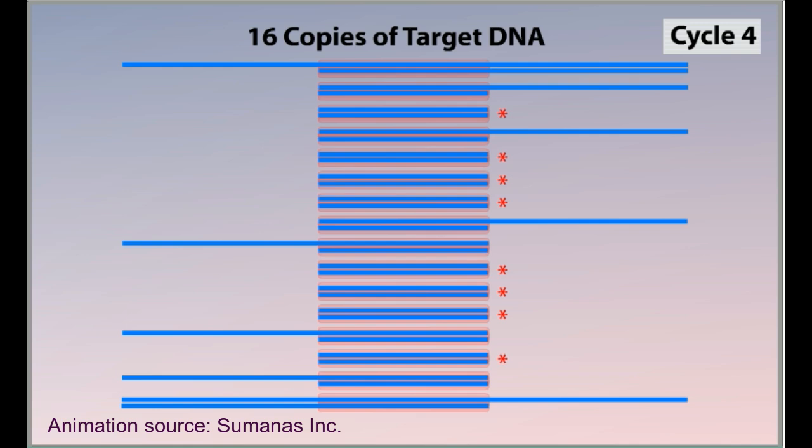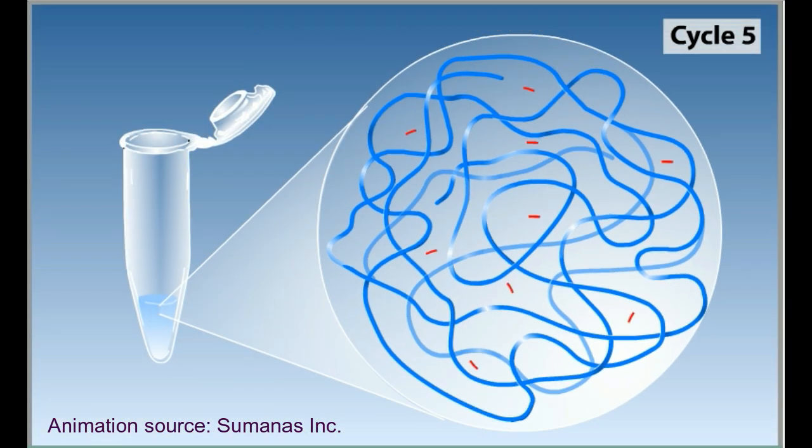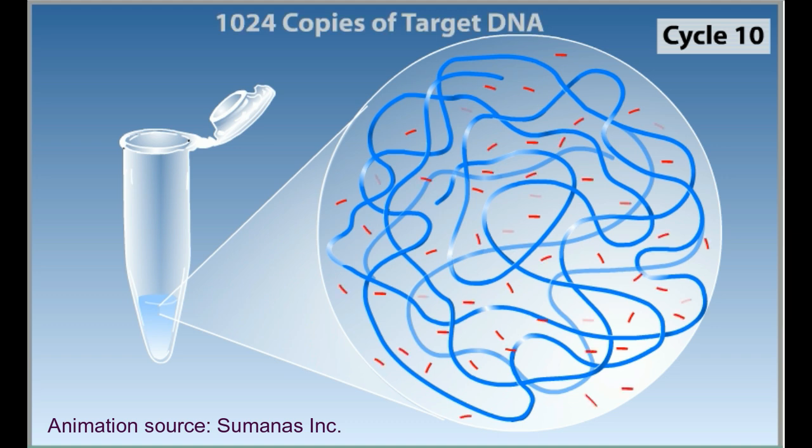With each additional cycle, the number of copies of our target sequence doubles. At the end of 25 cycles, there are more than 33 million copies of this double-stranded target region.